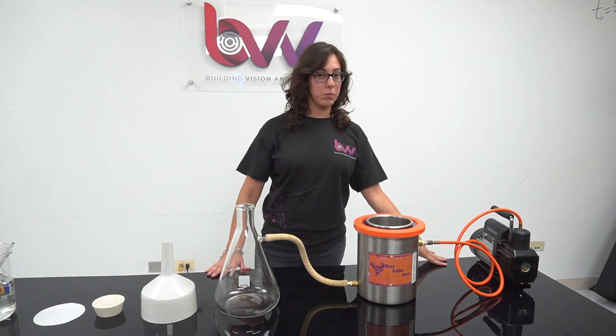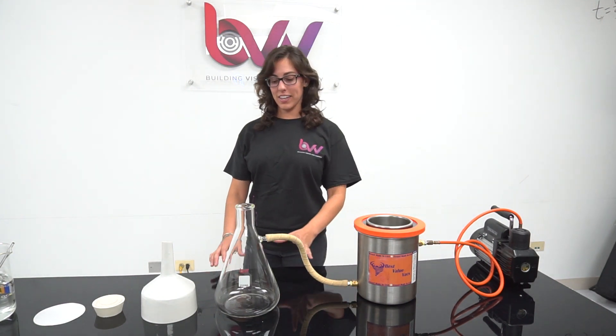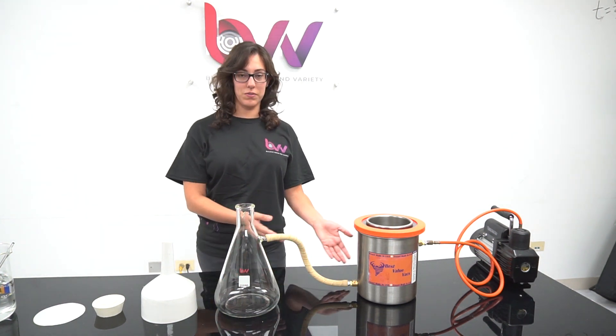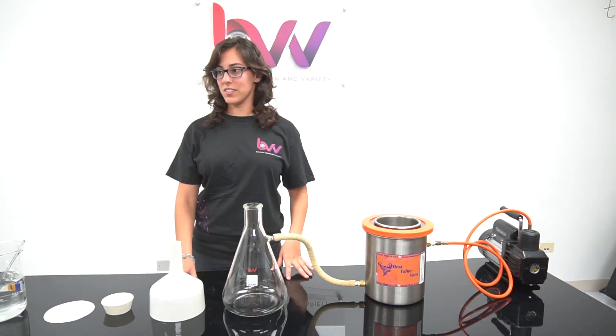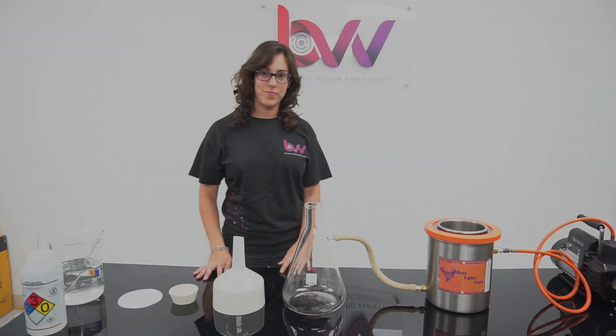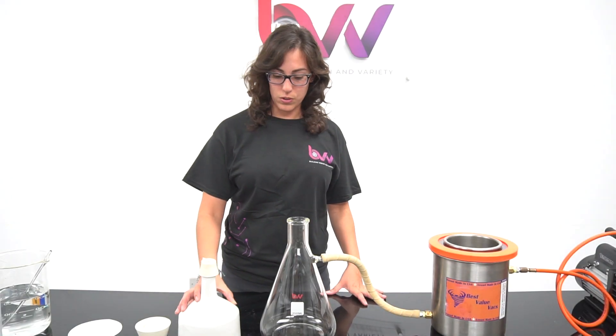Our kit is composed of a vacuum pump, a cold trap, a heavy walled conical flask with a side arm, which is good for vacuum, a porcelain funnel, some rubber cones, and filter paper.